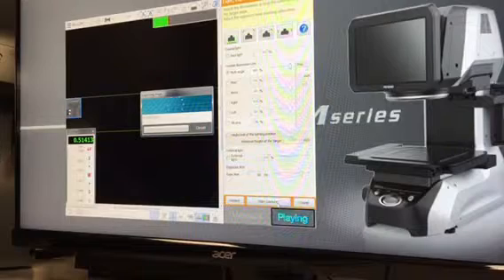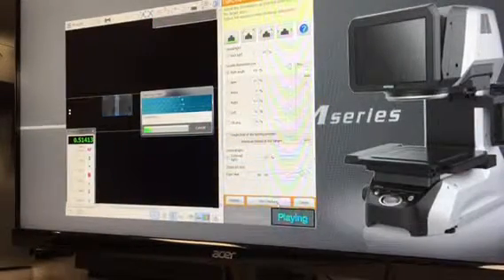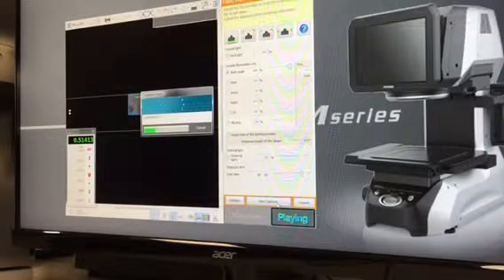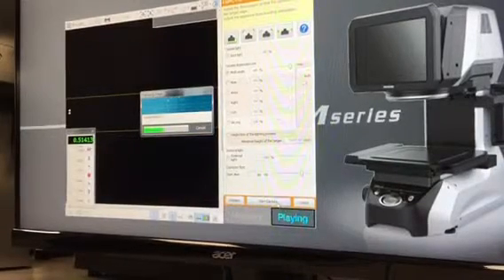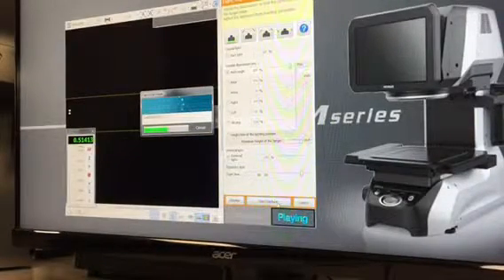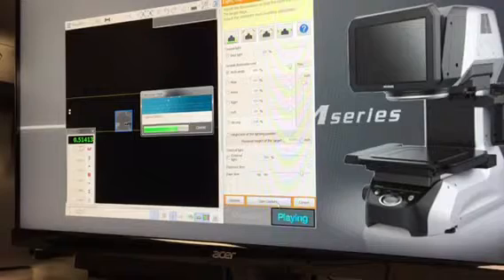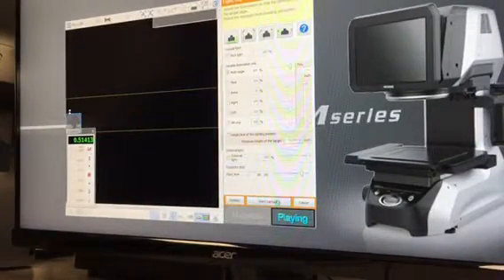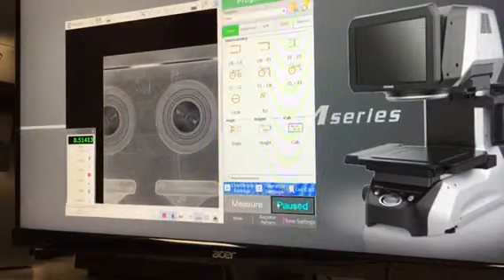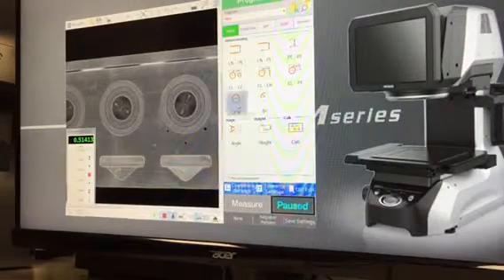I see. That's what I want. So see, now it's only taking 22 images instead of 66. Okay, I have to write that down. So when you go to File, New, Capture, click Capture image. Capture image, okay. And then adjust the area. Yep, adjust area. So for instance, I'm just going to do this one diameter.